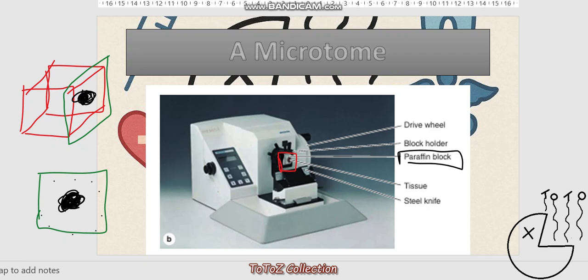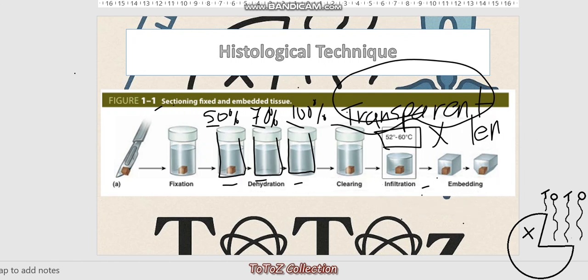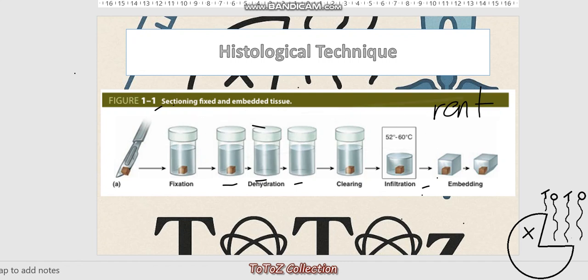Not so complicated, right? So those are just the steps that you need to know, beloved. You need to know these. A quick run through before we go to the next part of this histological process. So remember, first part is we cut it from the organ itself into that small size. We fixate it. What is the purpose of fixation? Halting all biological processes, denaturing all proteins, stopping all enzymes from degrading the tissue.